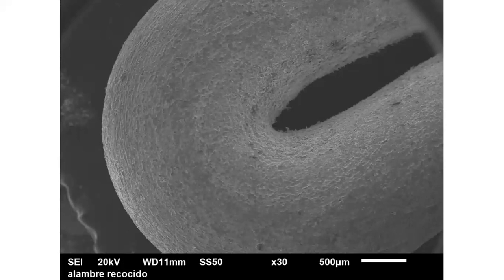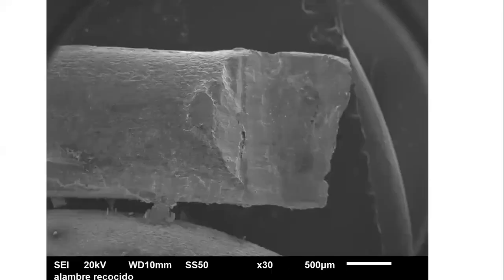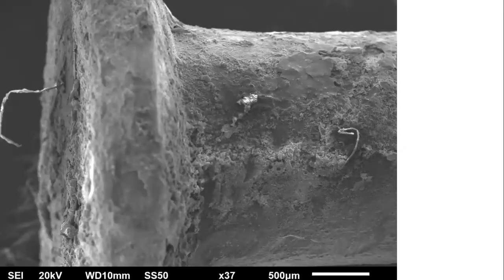Another sample that was analyzed was annealed wire. You can see that the annealed wire can bend itself 180 degrees without breaking, without showing any marks of breaking. Here we have a closer look at a cut of the annealed wire. It looks like some kind of clay, which was pretty easy to cut. And also we saw a rusty nail, a nail that was probably made of some kind of steel or iron.